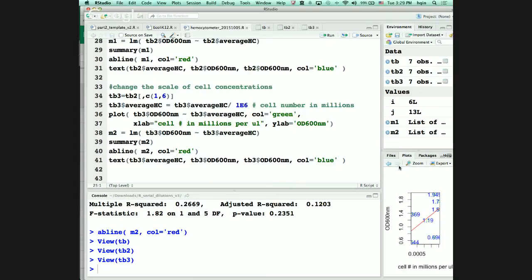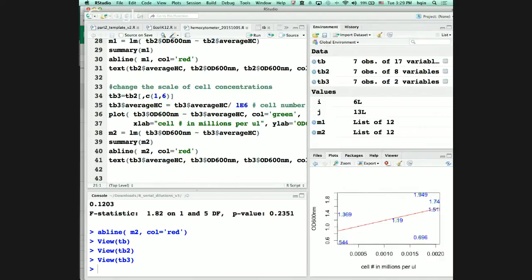And the way you showed us, like highlighting and pressing run, is that all? How did you get it to run first? You download the file, uncompress it, set the file directory properly, and then run the code. You know how to do that? If you know how to do that on your own, then you should be able to do that in the exam.